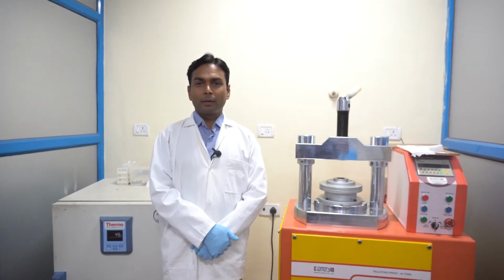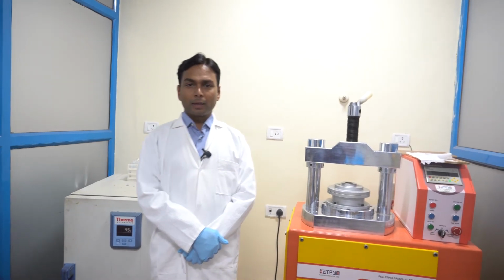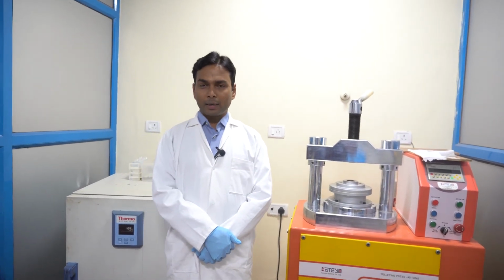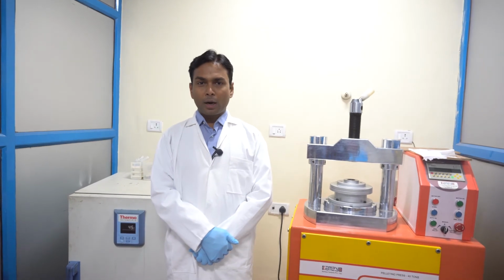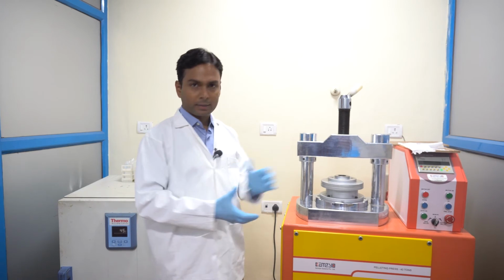Hello everyone, myself Kamlesh Kumar from Birbal Sahni Institute of Paleosciences. In the theory class, I explained the working principle of XRF. Here I am showing how the XRF works, with a hands-on experiment on the XRF.